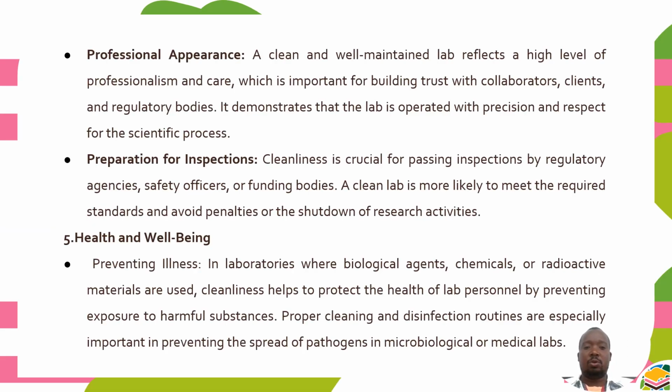Then in professional appearance, a clean and well-maintained lab reflects a high level of professionalism and care, which is important for building trust with collaborators, clients, and regulatory bodies. It demonstrates that the lab is operated with precision and respect for the scientific process. Then preparation for inspections.